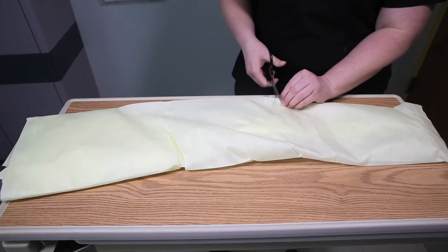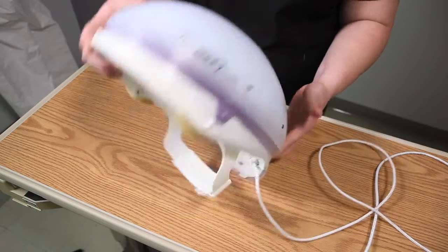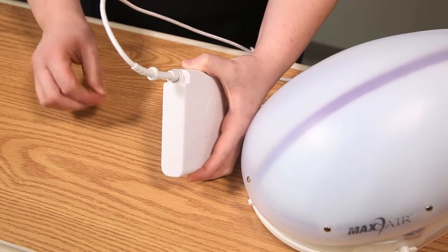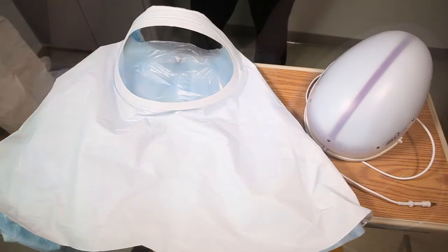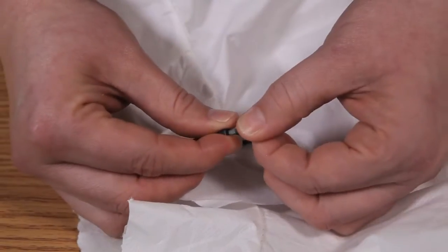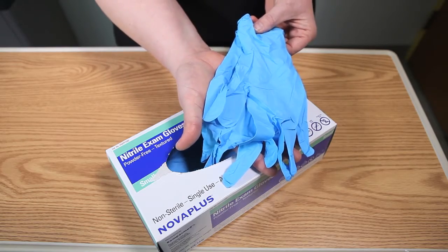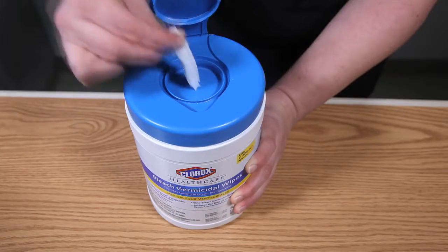Equipment needed for the patient health care provider: Isolation Gown — cut the isolation gown below the tie — Capper, Comfort Strip, Battery, Capper belt, Shroud, Jumpsuit — remove the hood from the jumpsuit — attach a zip tie to the jumpsuit zipper, one pair regular gloves, and one pair extended cuff gloves.